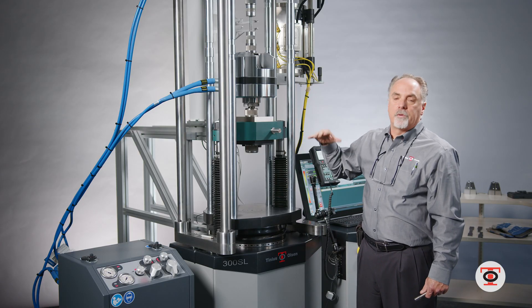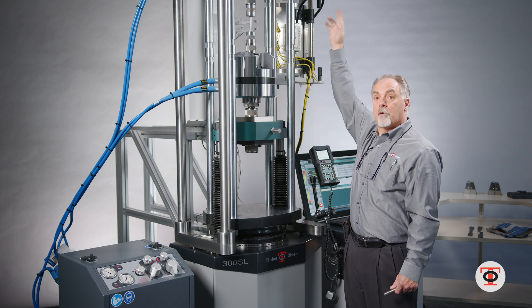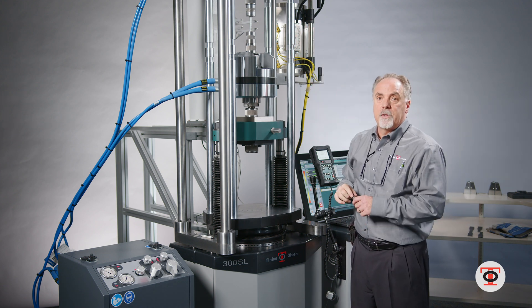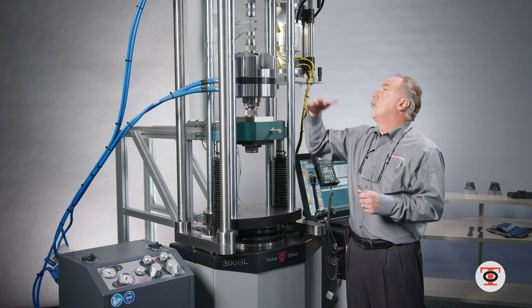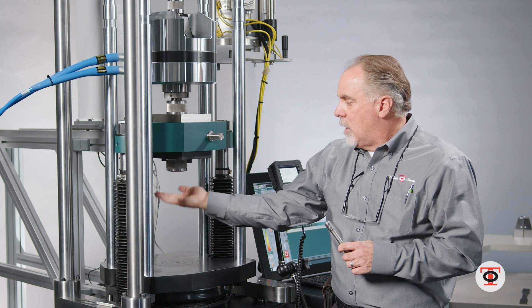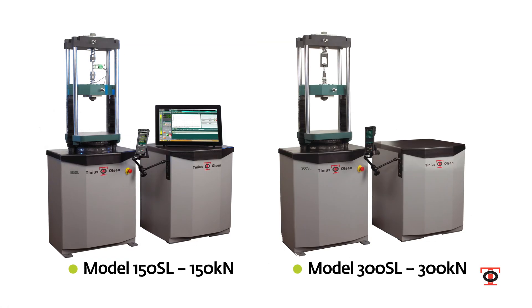The SL line is completely configurable. You can have a fixed standard height head, fixed one-foot, two-foot, or three-foot head, or in this case I have a three-foot adjustable head that you can move to different positions for different types of tests — whether it's your specimen length or you have bigger grips that need a longer specimen. As you can see, I can move the head down a good six more inches to accommodate a longer specimen.